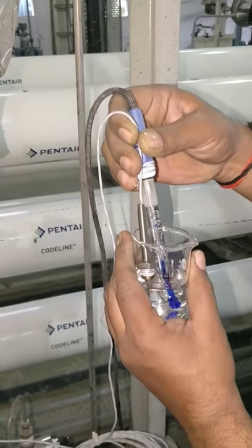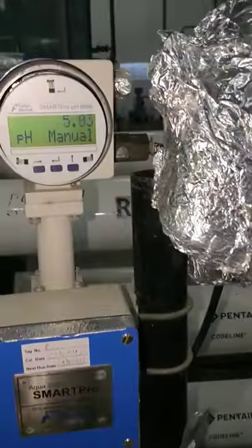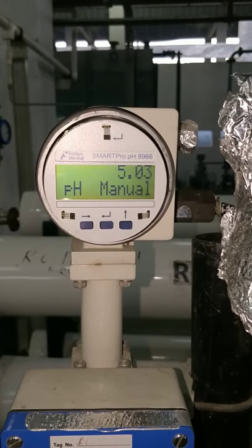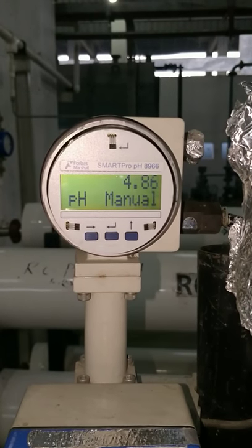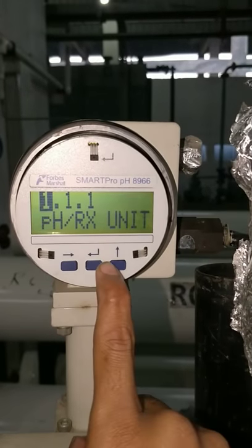Now, we have inserted the particular probe and RTD in the 4 PH sample. The reading will come down to 4 — slowly it will come down. Now, we will go to the calibration mode.